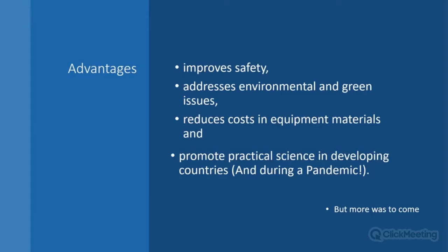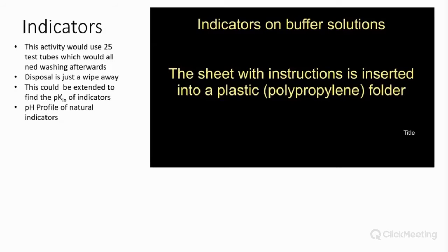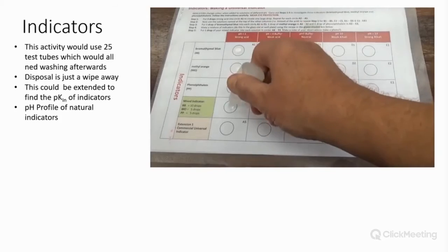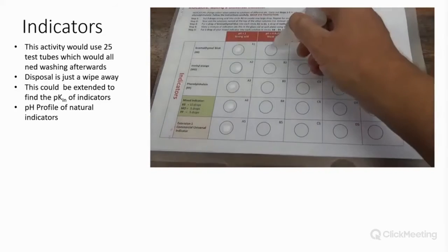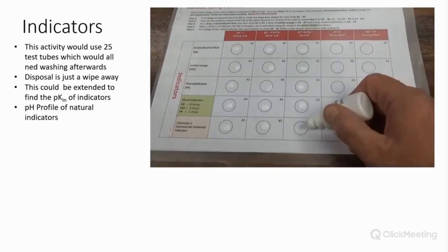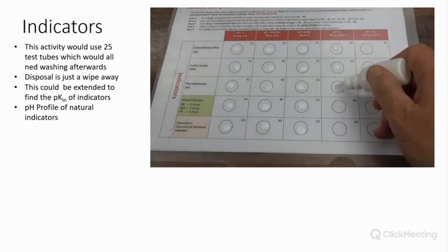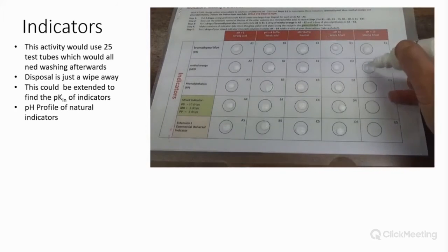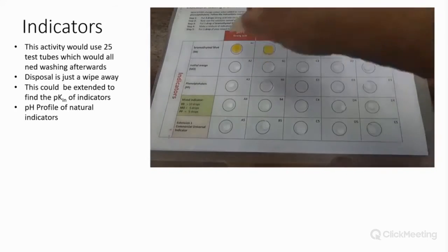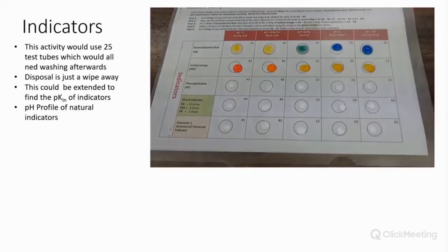So what we're going to have a look at is one of my opening experiments, which I carry out in my workshop, which unfortunately I've not done for a year because of this horrible virus. So here we go then, putting the sheet down, and I'm putting buffers down the columns. Then I go across with the indicators.